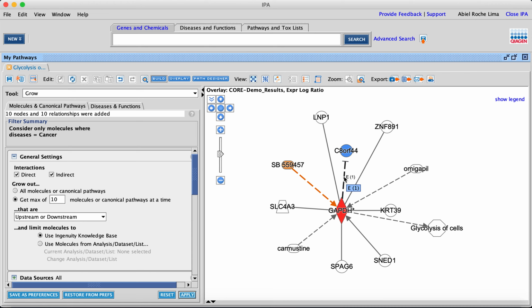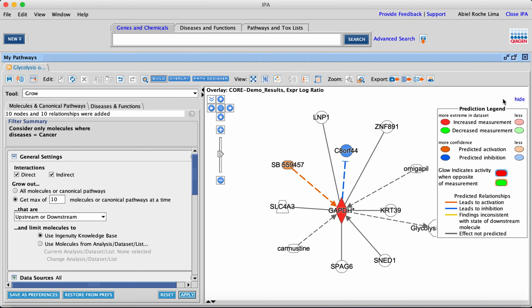So this confirms the example that I was providing to you before: not necessarily if something is upregulated will it lead to activation of everything. But some things, when a protein or a gene is activated, it is because something else is less activated, not activated at all, or in specific terms, less abundant or downregulated.